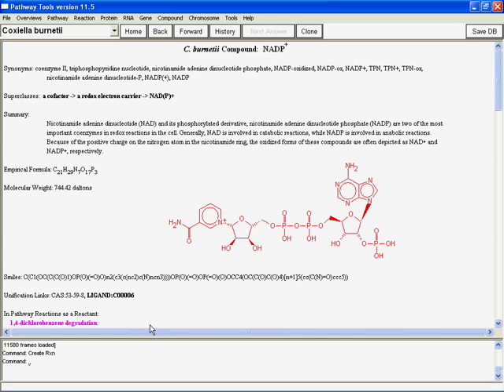So that's the basics of editing and generating a reaction. It's very straightforward. The one additional detail that we might want to talk about comes in making compounds, and compounds can be automatically generated if you type them into a reaction and they don't exist yet. Now we're on a compound frame here. I can always make a new compound. When I make a new compound, there's not going to be a lot of information loaded in. There's going to be almost nothing, in fact.